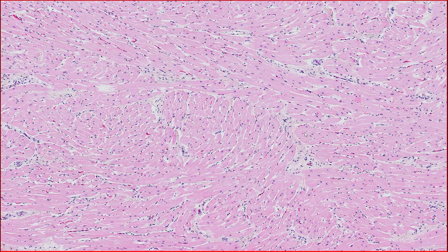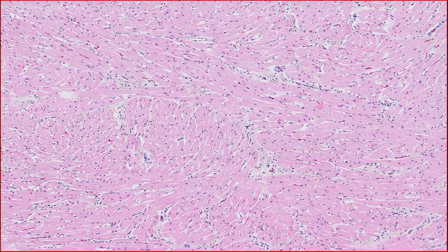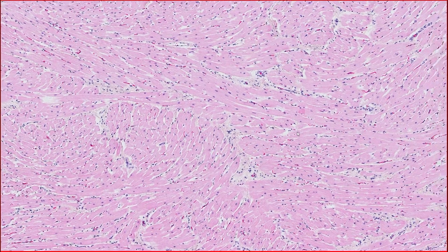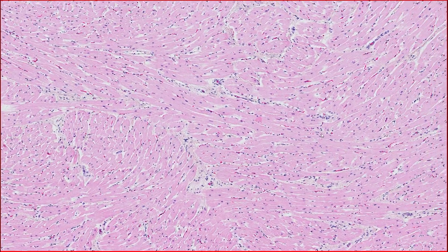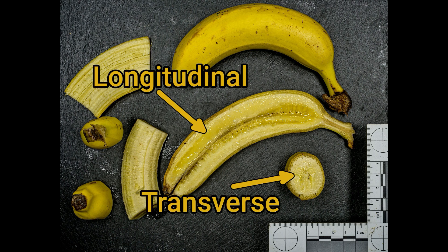Now, on to the meat of heart histology — the cardiac muscle itself. A key point to remember is that cardiac muscle fibres can be seen in either transverse or longitudinal sections, but most identifying features are visible in longitudinal sections. So let's find a region where the muscle is well-sectioned longitudinally.